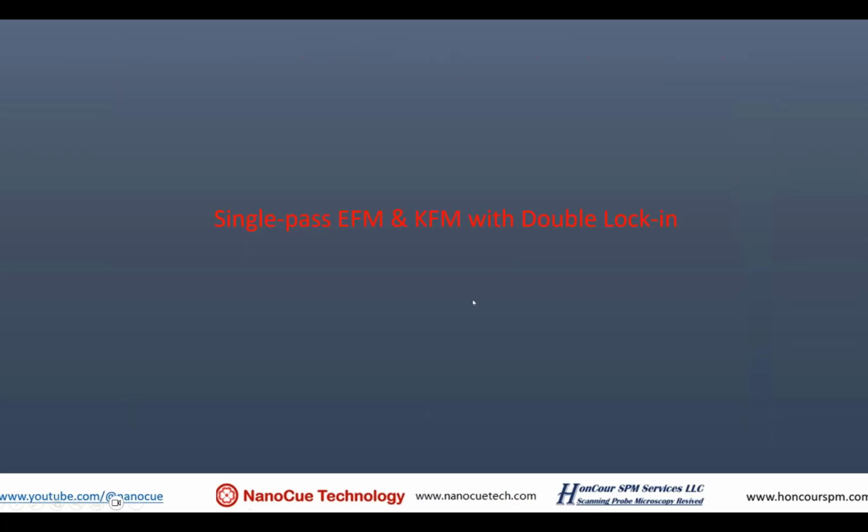So a single pass EFM-KFM uses a double lock-in. This is a much later technology. The lift mode works well with one single lock-in. However, tip and sample have a separation distance. So when the tip lifts over the sample, there's a separation distance, and your resolution cannot surpass the separation distance. The further you separate, the less resolution you will get.